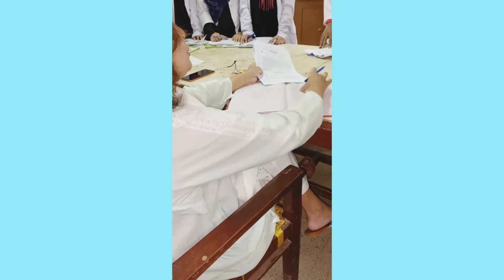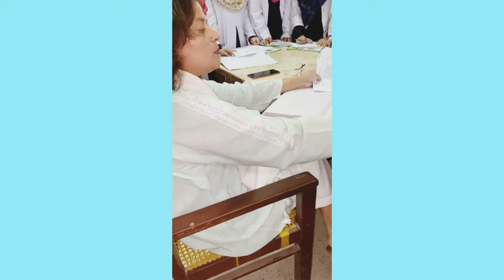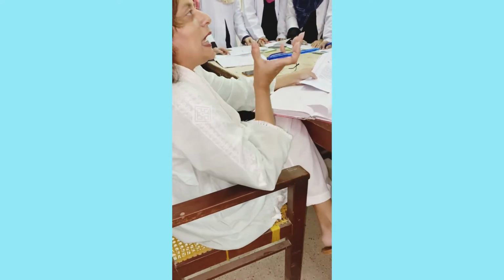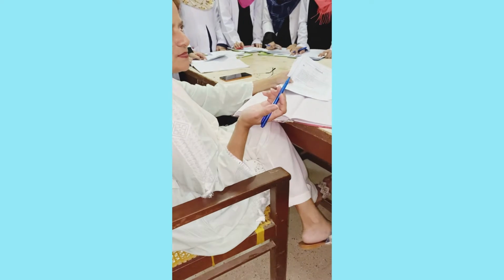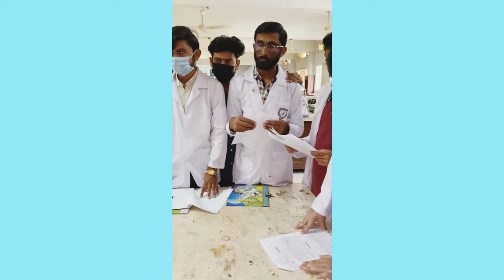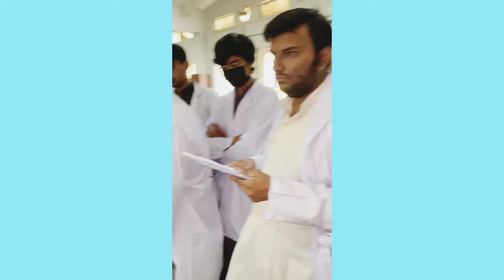Number 2, now your object, read your object. To synthesize P.Nitro acetanilide from acetanilide and calculate the percentage yield. That means you're going to calculate a yield. Now what is the yield? The final product you are going to get in the end. The product you are preparing, the compound you are synthesizing, is called the yield. What is the yield? You tell me. Final product.